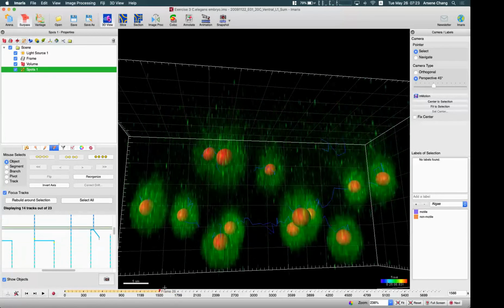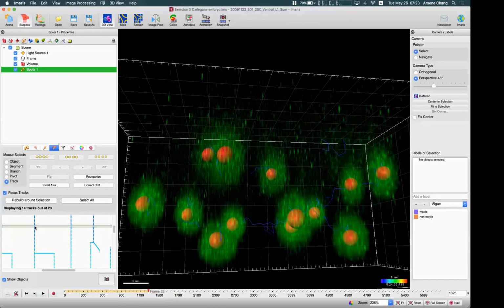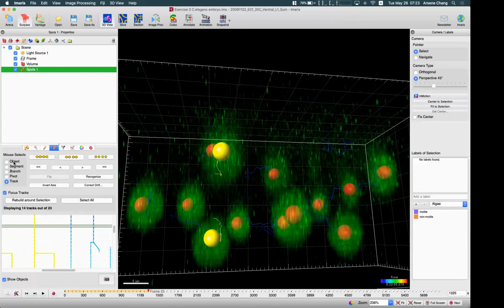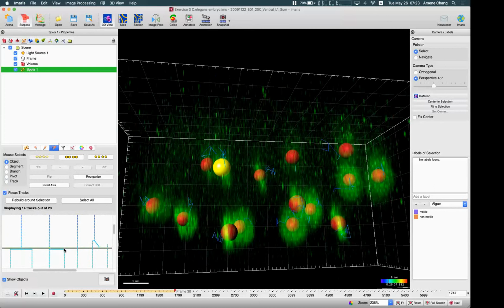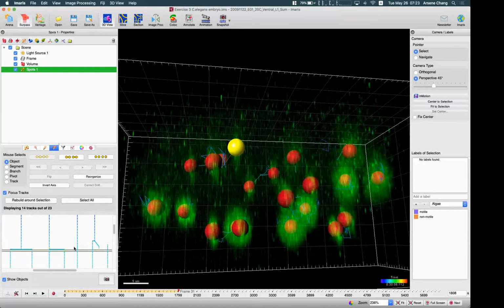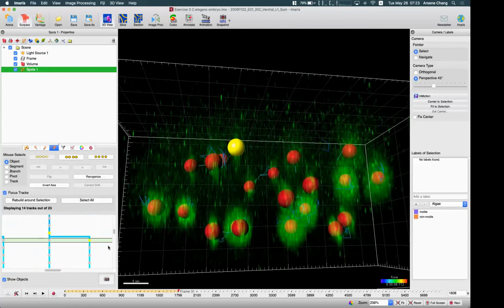So first we have to change from the tracks selection to the object. Then we can select the single object in the time point. And from where you want to edit, you just disconnect the original ones, then reconnect it to the correct one by selecting the object, like yellow highlighted. Then you can use Command on Mac and Control on Windows.